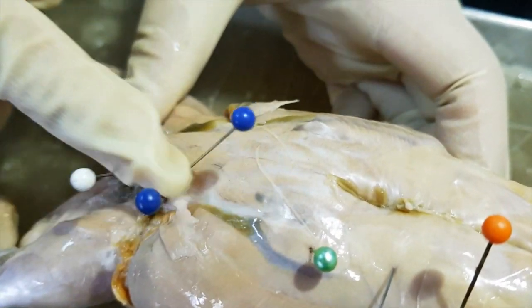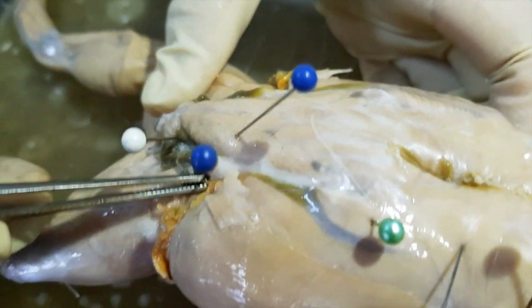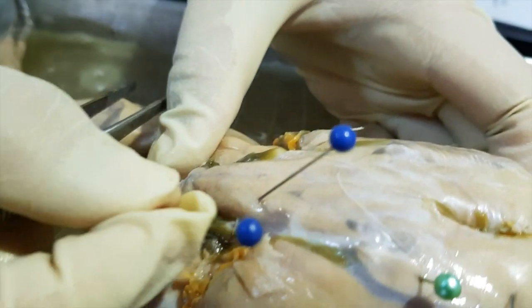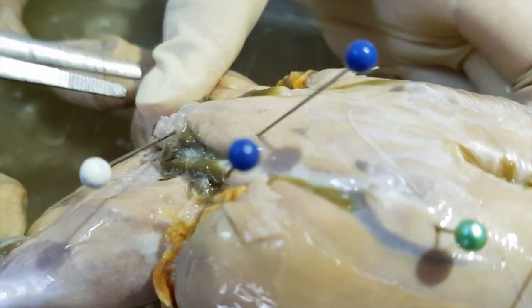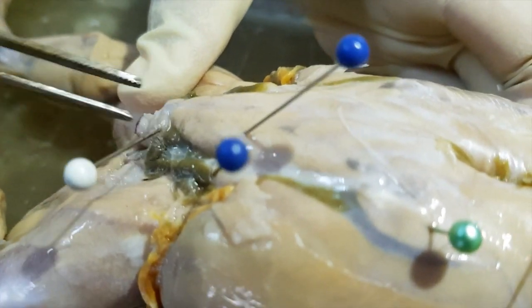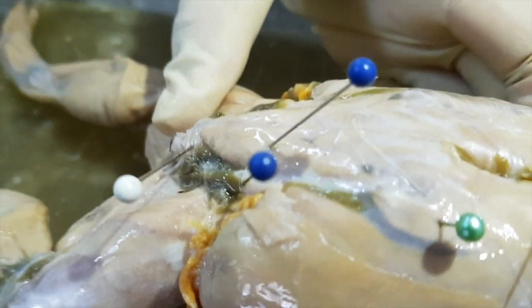This one, the blue, is the coccygeal iliacus. This muscle here is the gluteus, and this very small muscle towards the vent is the piriformis. Okay? Alright.